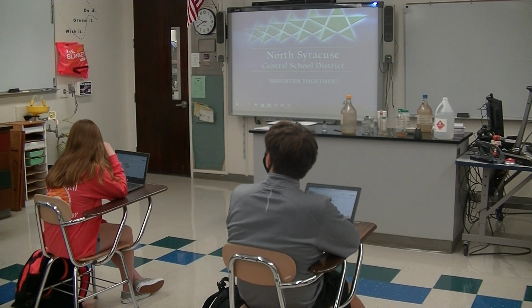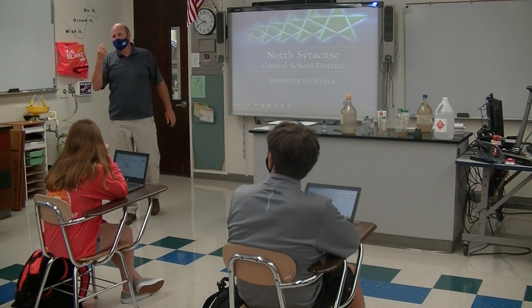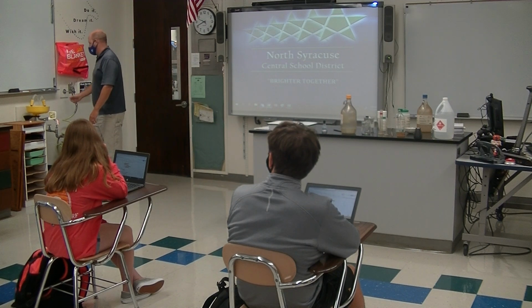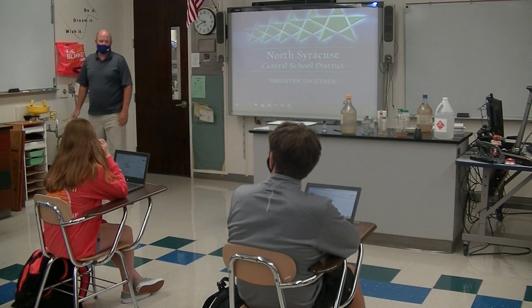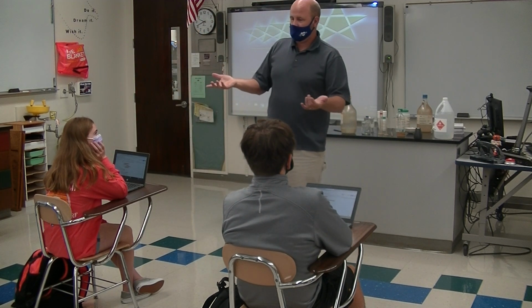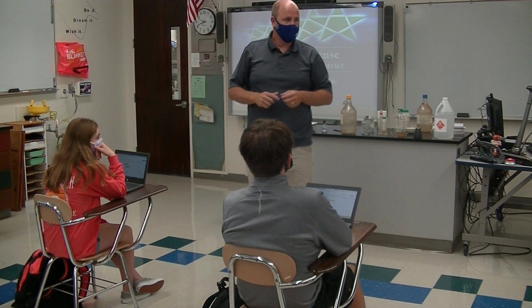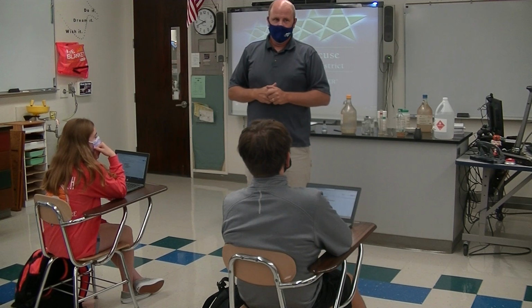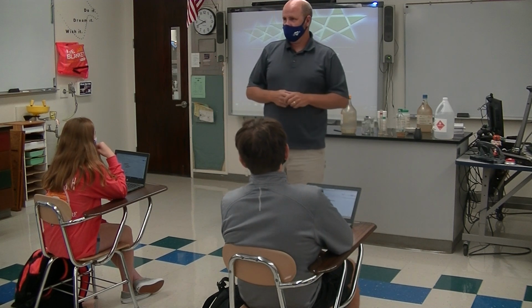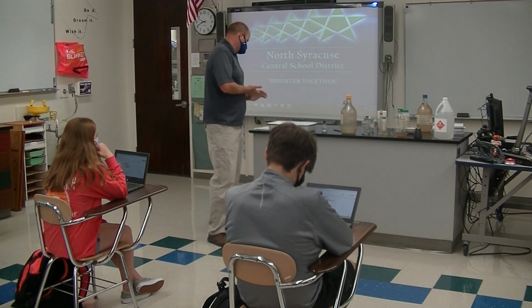So if you were to get a chemical in your eyes, you have to use the eye wash station for 15 minutes. That's for a chemical. If you have something in your eye, you don't have to do it for that long. But if it's a chemical we're worried about, then you're flushing your eyes for 15 minutes. You can practice at home: take a shower and try to hold your eyes open for 15 minutes. Cold shower, that's cold water, not hot water. It's not a fun thing, so hopefully we don't have to do that.